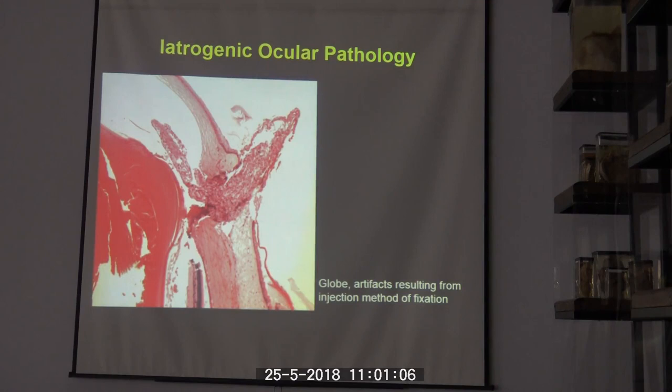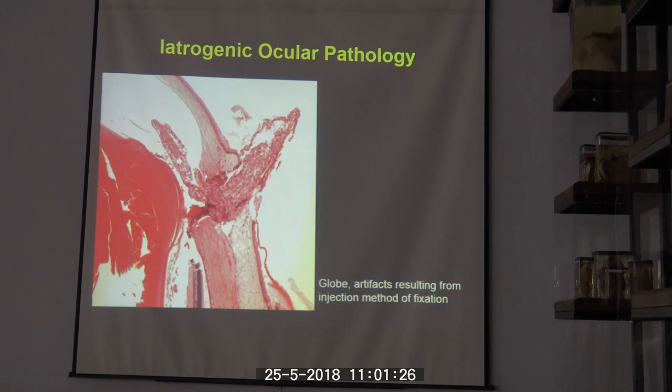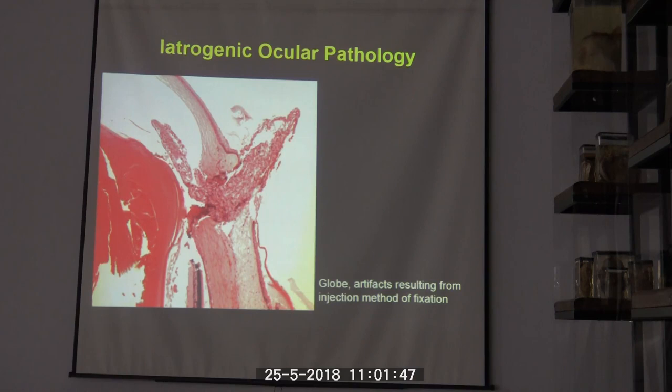We had one case where adipose tissue was injected into the subretinal space — we were initially stumped, as you don't expect adipocytes within the globe. We then found out it was an ostrich eye that had been injected at the time of necropsy, and a little white spot at trimming that looked like a real lesion was actually artifact. Once informed of the injection, we disregarded that change.